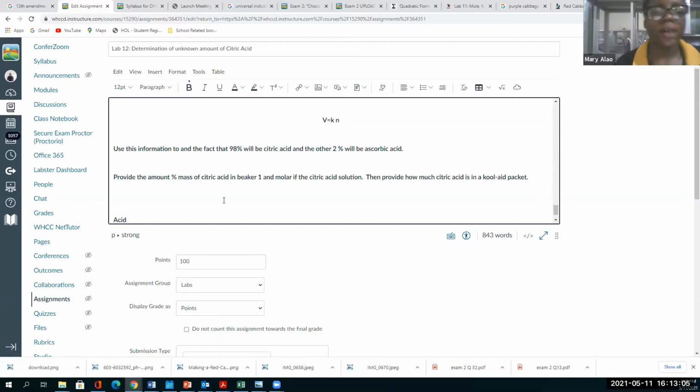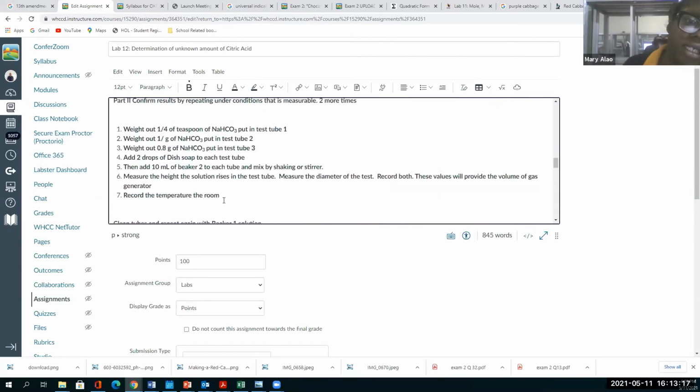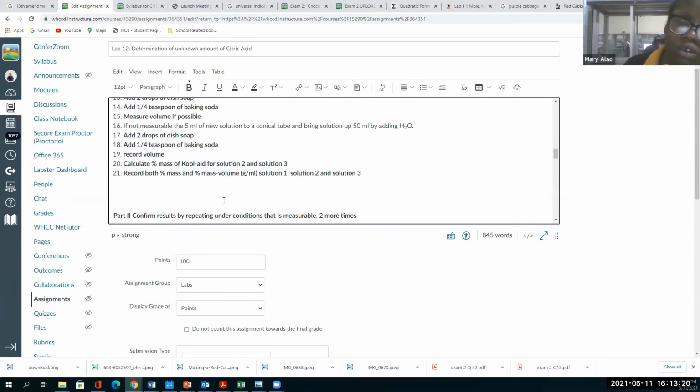Dr. Henry, I'm a little bit worried, I'm quite behind. At this stage, after number 21, you say in number 1 to add 10 milliliters of Beaker 1 Kool-Aid solution to a 100 milliliter graduated cylinder. Since my solution is very weak, I am worried that's going to over dilute it. So what do I use?